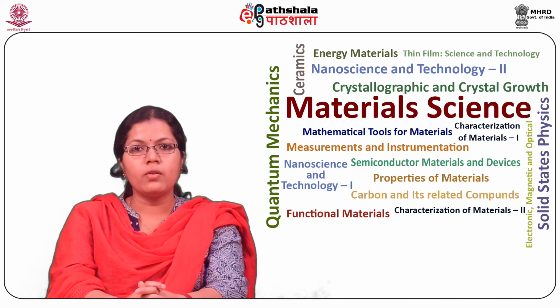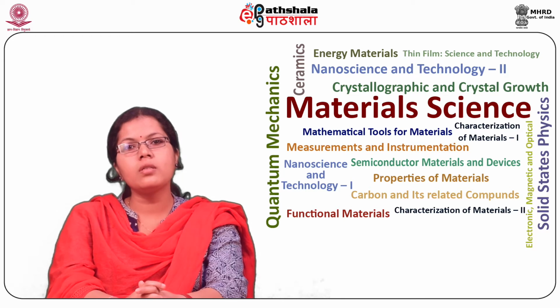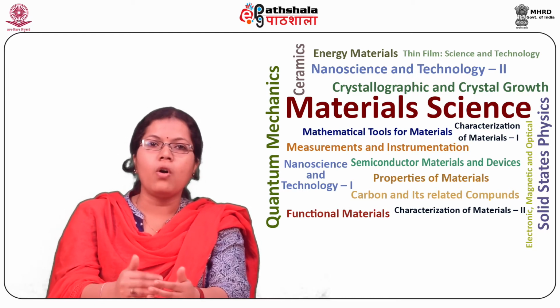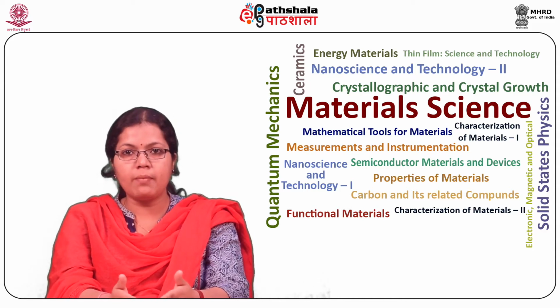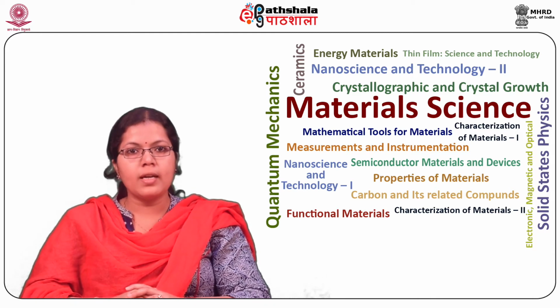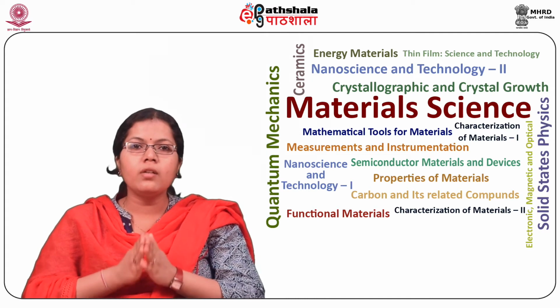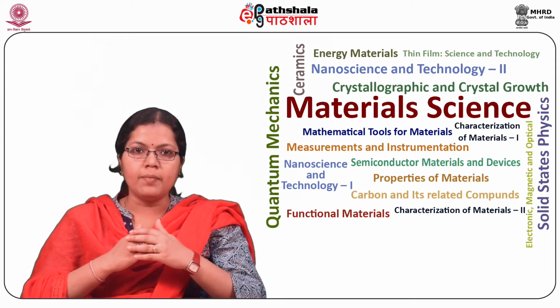In electron microscopy, electrons emitted from a source are accelerated by an applied voltage, which can vary from a few kilovolts for SEM to a few hundred or even thousand kilovolts for TEM. The high energy electrons are focused to a fine probe on the sample, or the bulk or specially prepared thin samples. The interaction between high energy electrons and the atoms of the sample gives rise to a variety of signals. The detection and quantitative characterization of the signals form the basis of SEM and TEM.